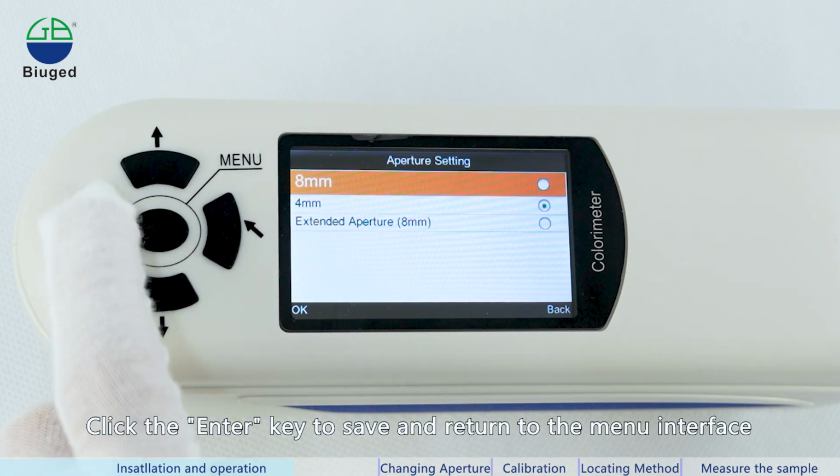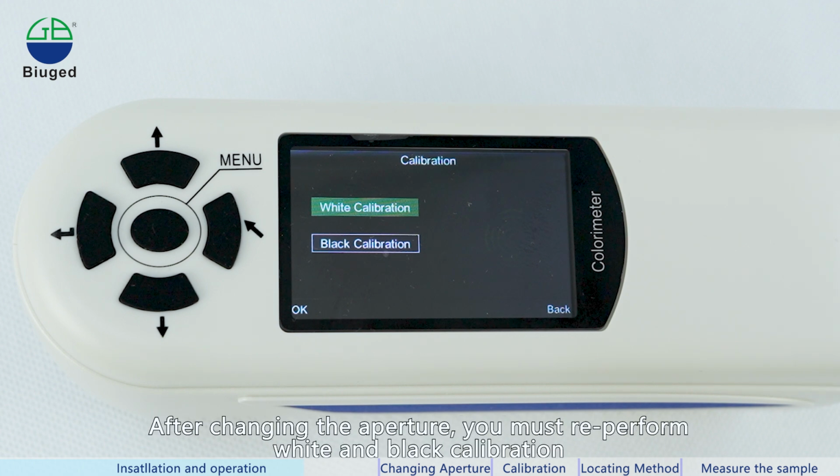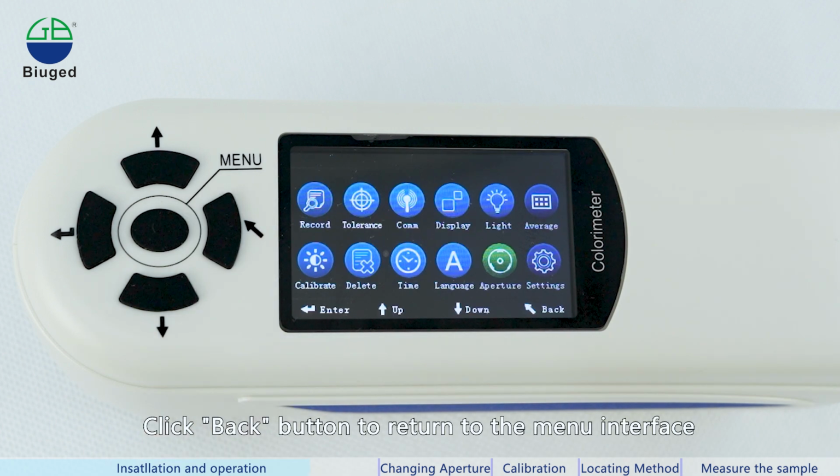Click the Enter key to save and return to the menu interface, and enter the white and black calibration interface. After changing the aperture, you must perform white and black calibration again. Click the Back button to return to the menu interface.